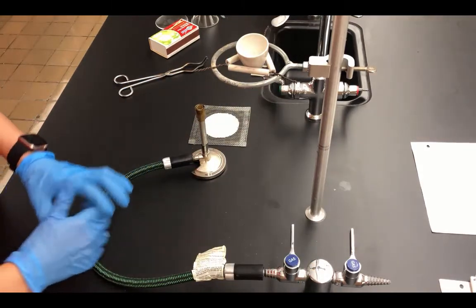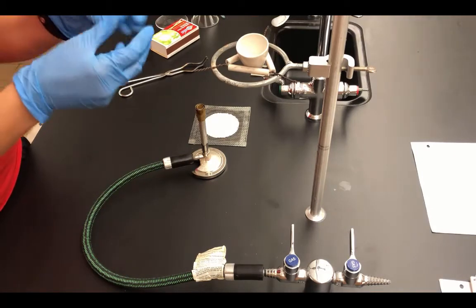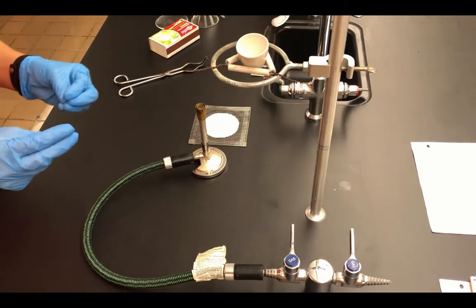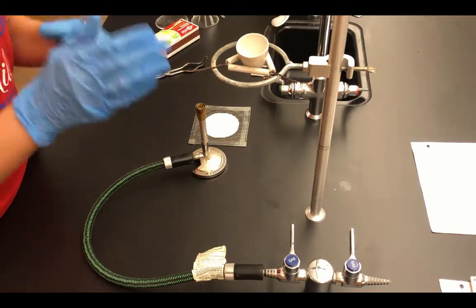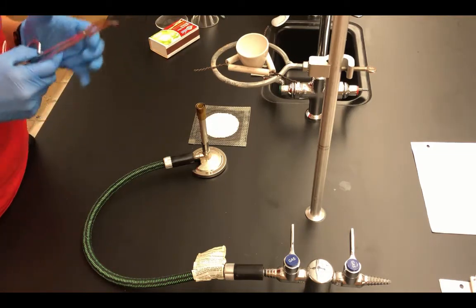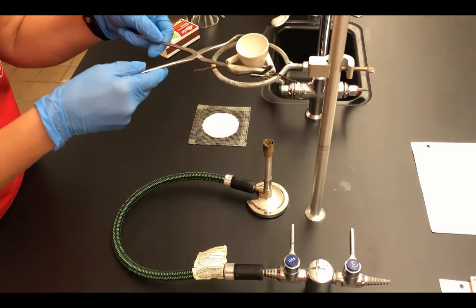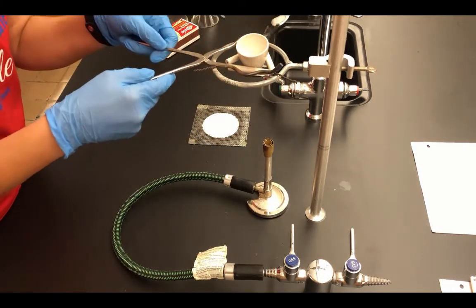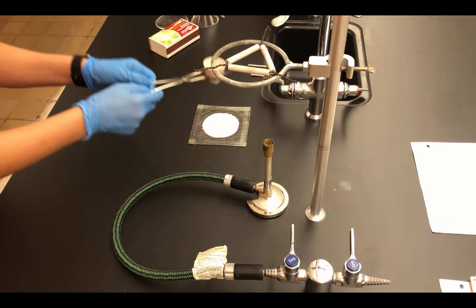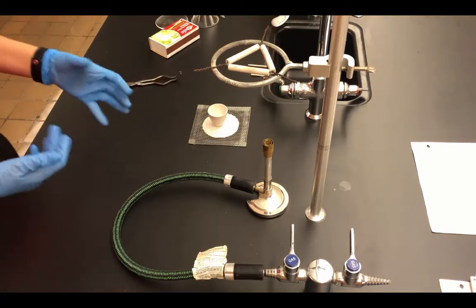So I just stopped fanning. What I noticed is that some of the unknown started popping, almost like popcorn. So I'm going to stop and let it cool. To let it cool, we're going to use crucible tongs and remove it from the clay triangle, because the clay triangle and the iron ring will be very hot. I'm going to very carefully, with both hands, pick up the crucible and set it onto a ceramic pad and let it cool completely.